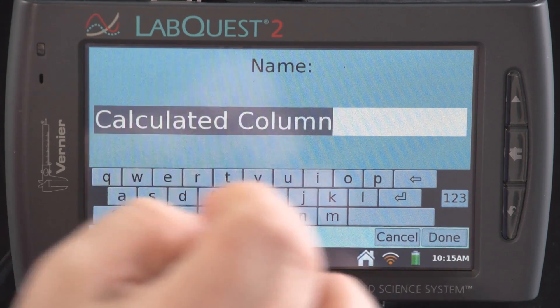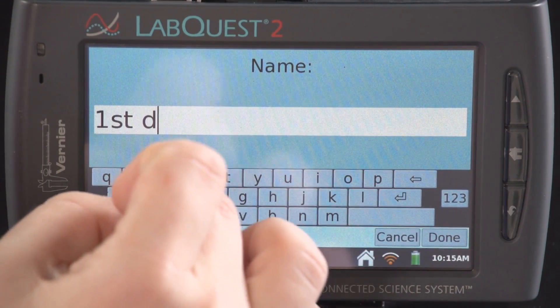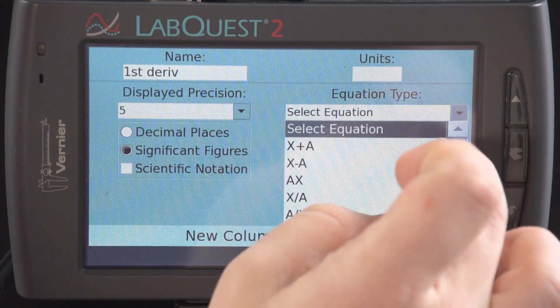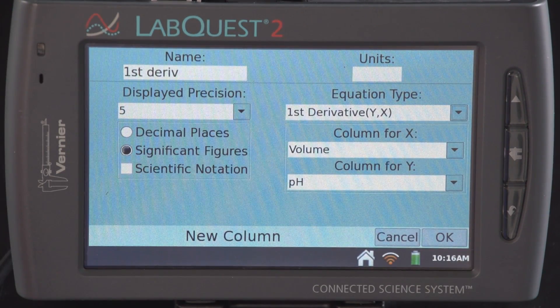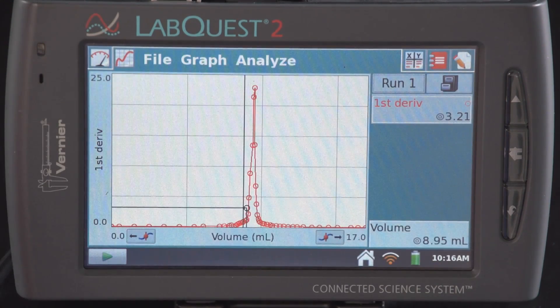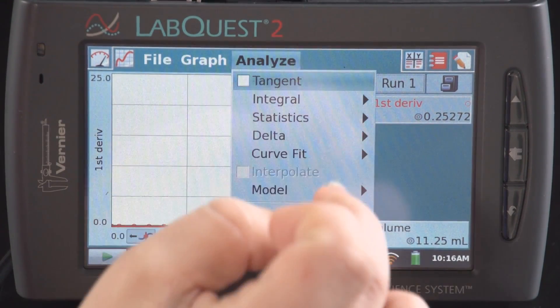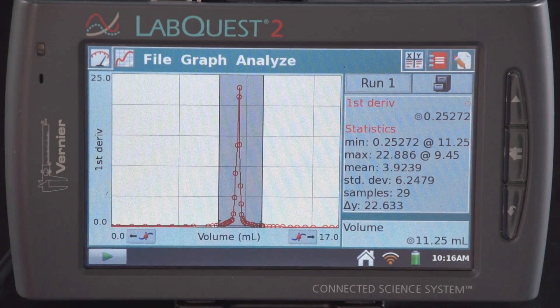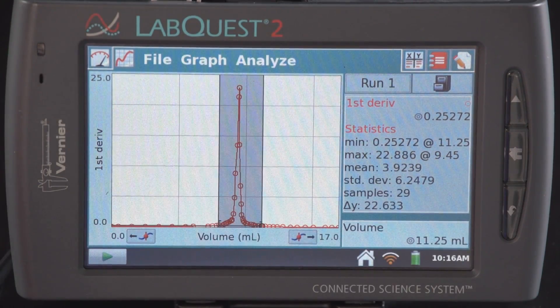I want this to be the first derivative, so I'm going to rename the column 'First Derivative.' Now I'm going to select from the Equation Type menu, scroll all the way to the bottom, and tap on First Derivative. Then I'll select OK and it's going to automatically take me to the graph screen where it's graphed the first derivative for me. I can then use the statistics analysis after highlighting the peak to find the volume where the maximum happened. I can see here my volume is 9.45 milliliters.